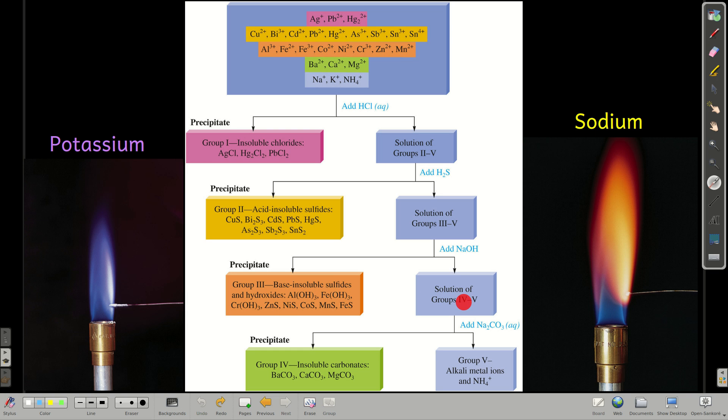Now we have the last two groups left. We add sodium carbonate, a soluble carbonate. Potassium carbonate probably would work as well.